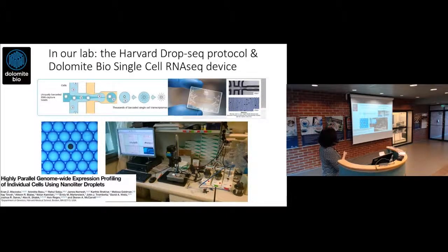And now these cells and beads are randomly entering these droplets. So many of the droplets are just empty. In some of them there is only a bead. Some of them have only a cell. But a small fraction of the droplets have 1 bead and 1 cell. And because the beads come with a lysis buffer, the cell is lysed right away in the droplet.